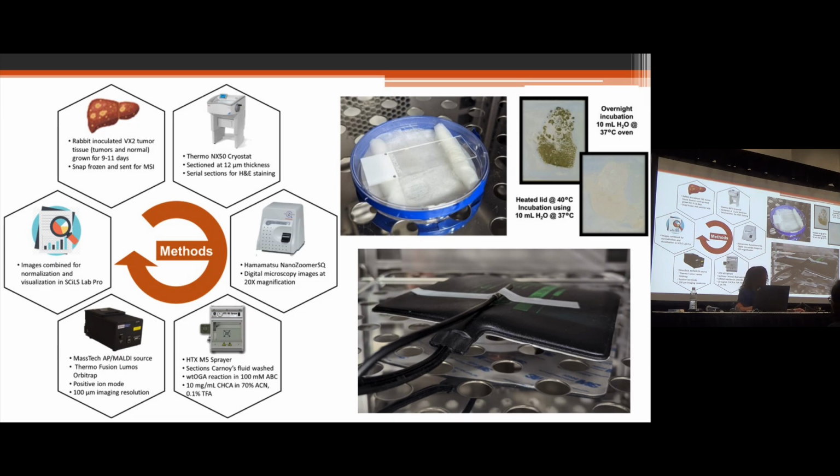But one of the things I want to point out that was a challenge in doing this is we needed a really high humidity incubation for the O-GlcNAc hydrolase. So we have what we refer to as, if I can get the mouse over here, our spa treatment. It's a piece of wool ball on the bottom and 2 rolled up Chem wipes that act as little pillows, your little spa pillows.